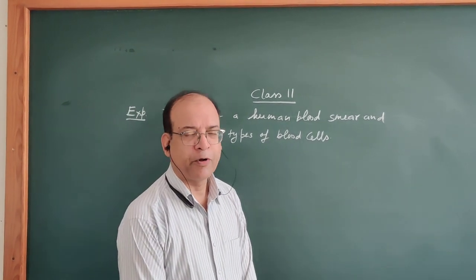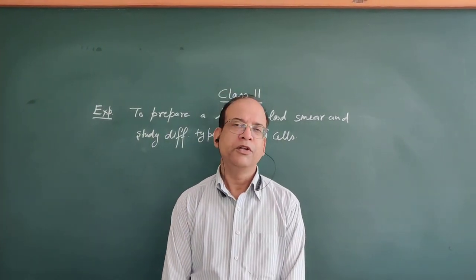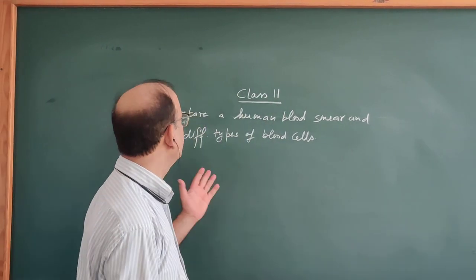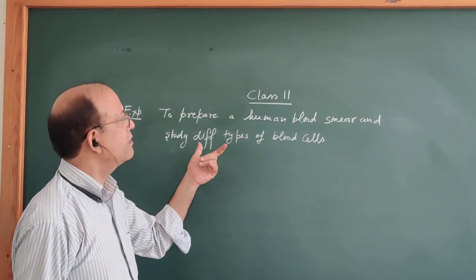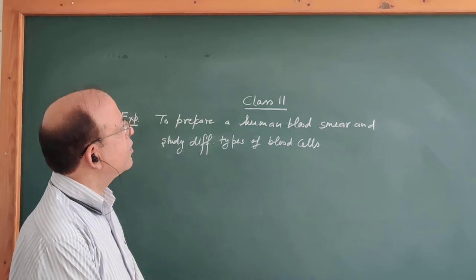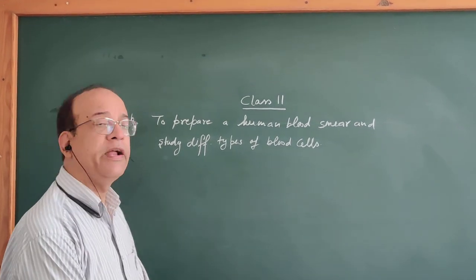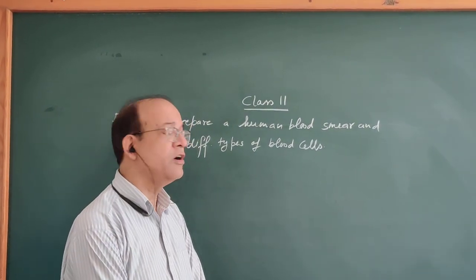Hello, good morning viewers. Today I am here to show you how to prepare a temporary slide of human blood smear and to study different types of blood cells.